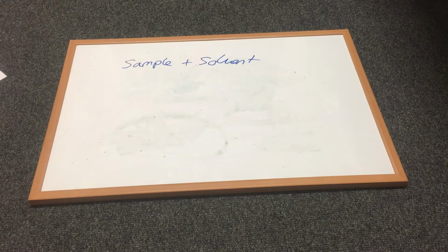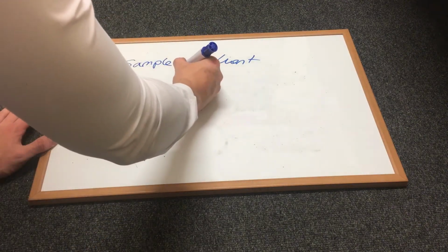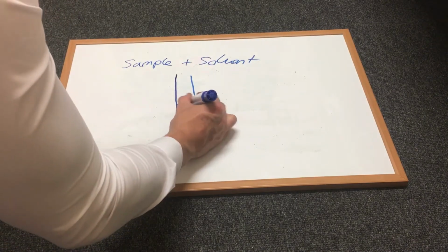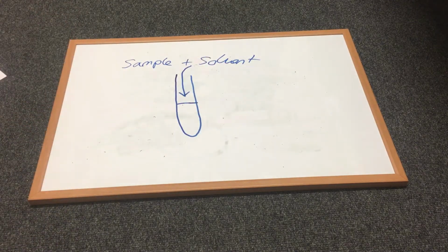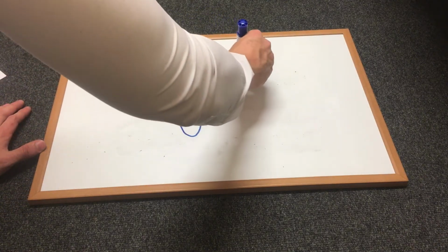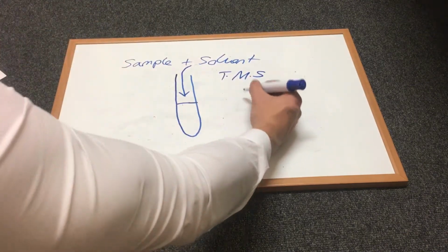Okay, let's now look how you'd go about running an NMR experiment. Test tube, and then into this test tube you need to add your sample mixed with a solvent, and I'll get on to which solvent you'd use in a minute. And you also add TMS, which is tetramethylsilane, and the structure of TMS follows.